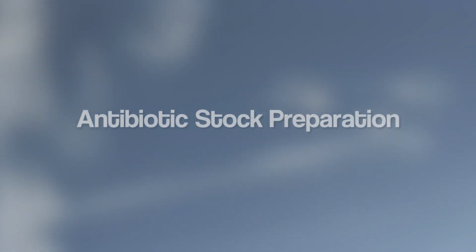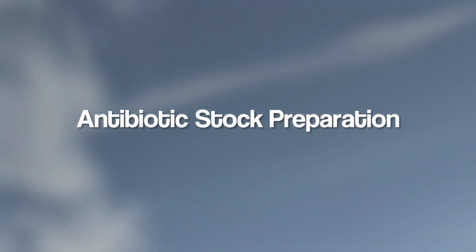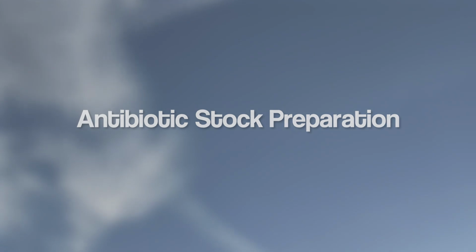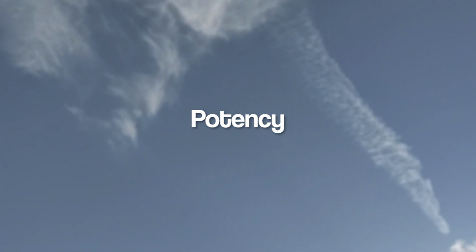If you don't have a rough idea of the expected level of sensitivity of your organism to your drug, it is generally a good idea to do 2 sets of MICs, 1 high and 1 low concentration. Here we are going to use a low concentration. As we have already predicted, our strain will be quite susceptible. It's important to adjust concentration calculations for the potency of the antibiotic you are using. Potency is expressed as a percentage of the activity of the antibiotic being tested against its pure form.